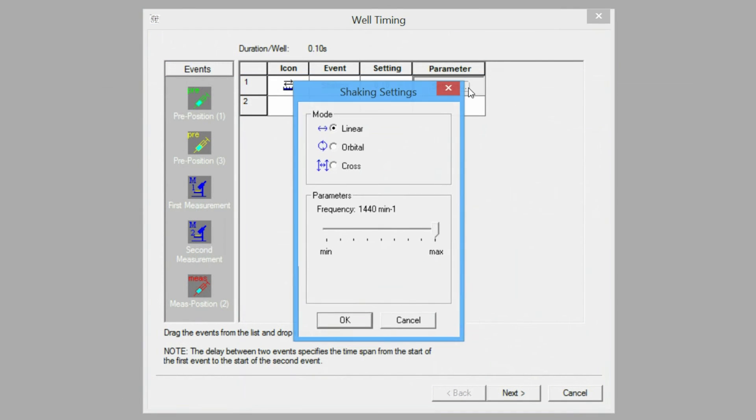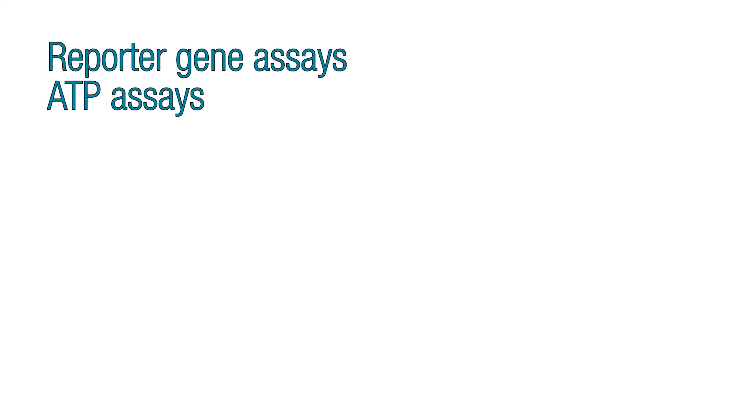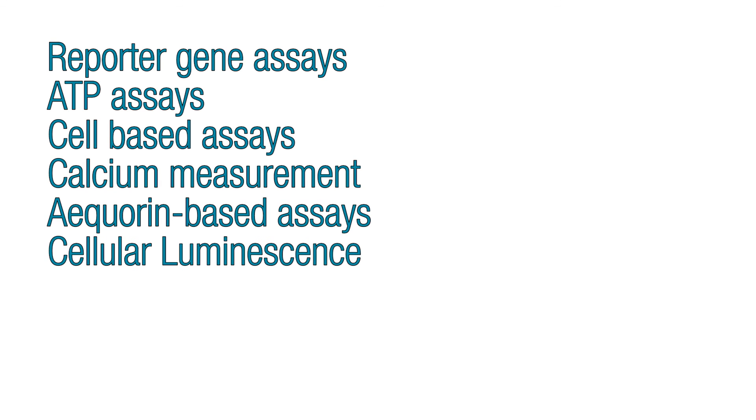Samples can be incubated up to 50 degrees Celsius, and for assays that require shaking, three mixing modes are available. Orion II — the highest performance for your lab and just the right instrument for your luminescence applications.